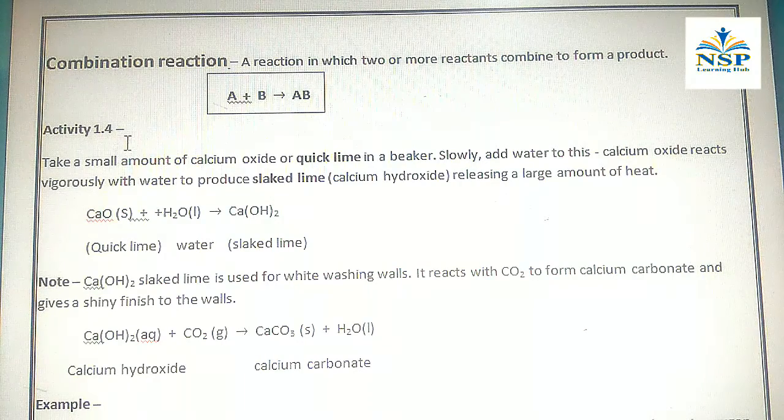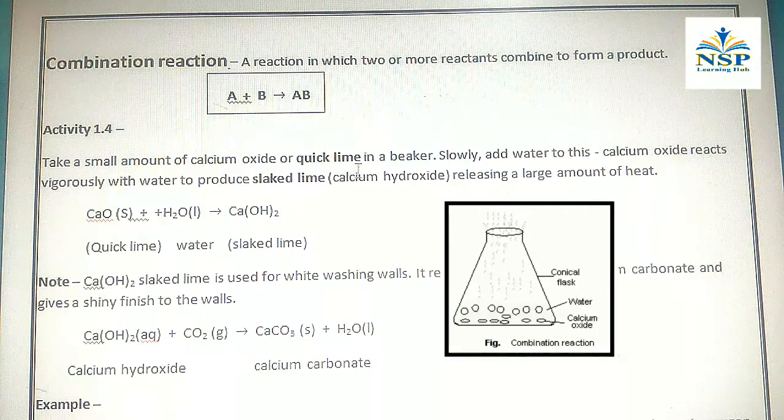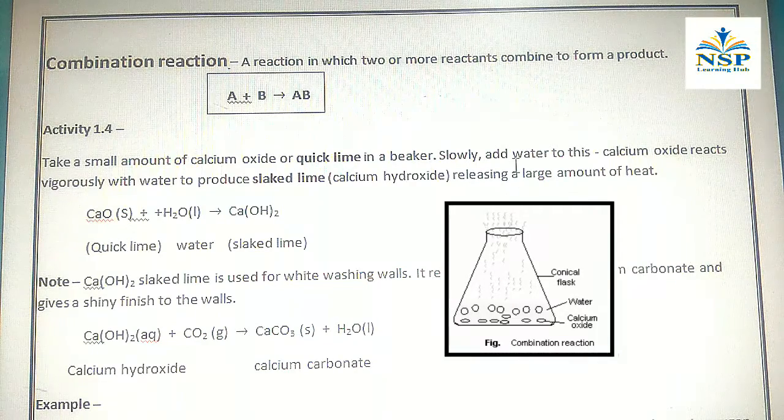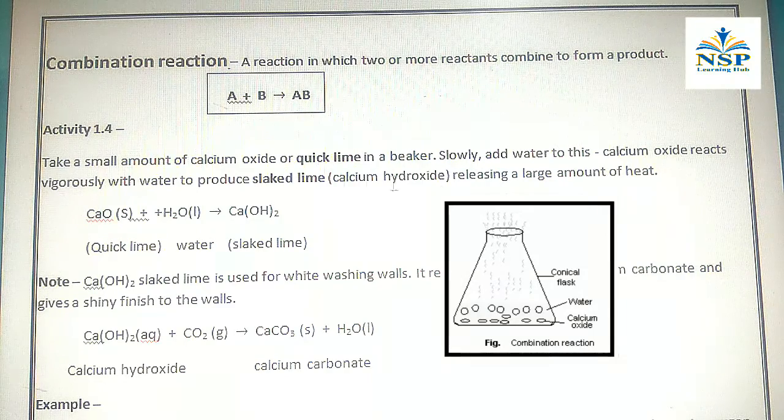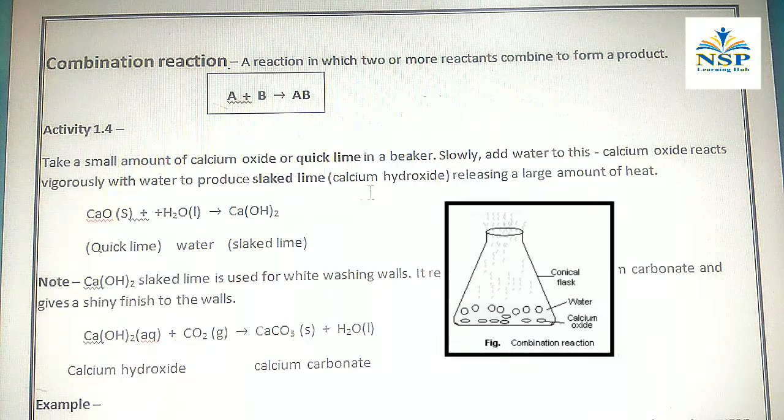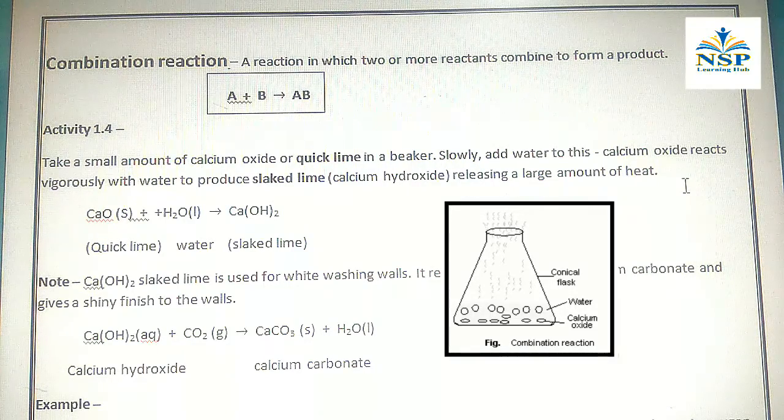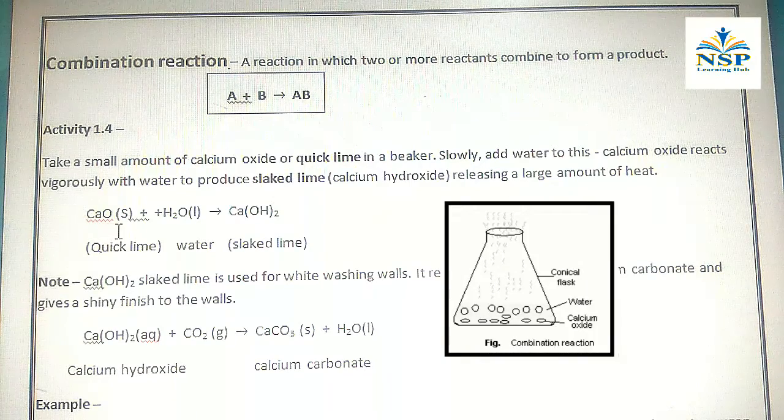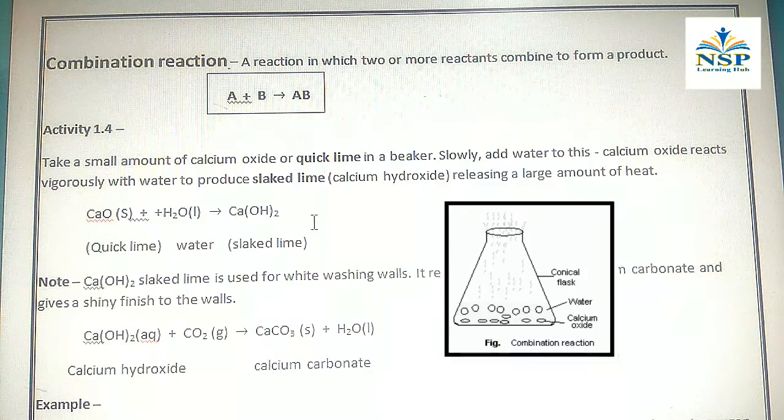Activity 1.4: Take a small amount of calcium oxide or quick lime in a beaker. Slowly add water to this. Calcium oxide reacts vigorously with water to produce slaked lime, calcium hydroxide, releasing a large amount of heat. CaO plus H2O gives Ca(OH)2.